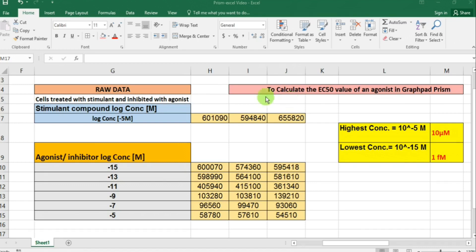Here at the top I have stimulated my cells with a stimulant drug at a single concentration of minus 5 molar, or 10 raised to the power minus 5 molar — basically a log concentration.